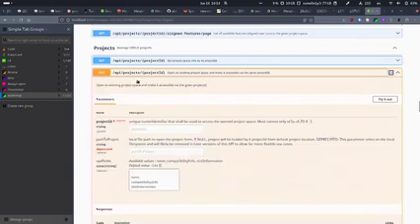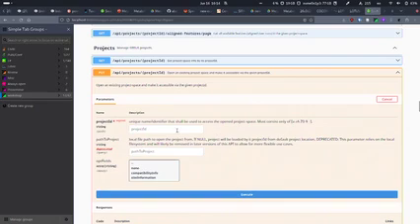open up a new project space. You would just go here, and you can click on the try it out button, and then you can, for example, just specify the path to your project space and load it in. And you can pretty much do everything, like all the actions you did in the GUI, you can also use it programmatically. And also, for example, you can get the spectra which SIRIUS has this way. Yeah, just to highlight this very quickly.